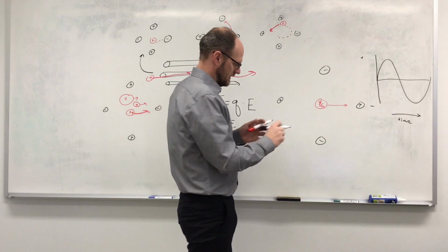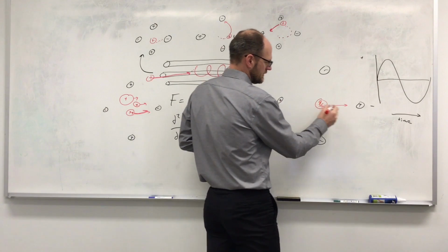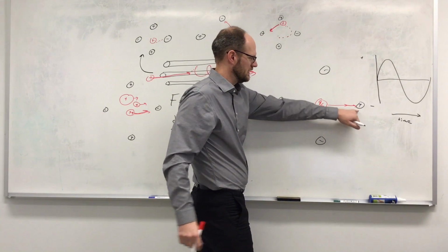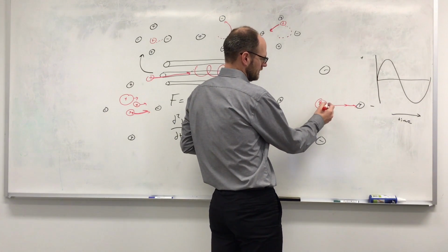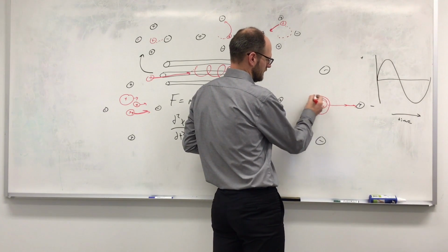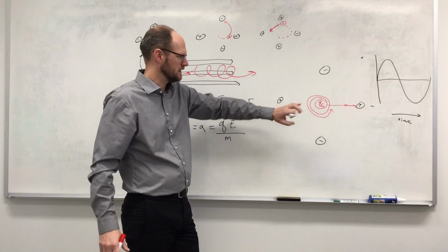So what that does here is for very small particles, they still run so quickly towards this pole that they just run into the rod and they get destroyed. And very, very large particles barely move because they're so massive. They don't respond very quickly to these changes.